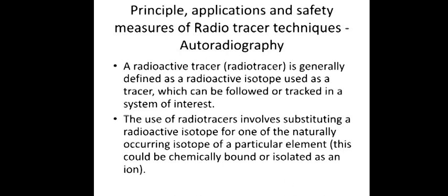So you are basically using the principle of radioactivity, knowing that there are certain isotopes which can decay over time by emitting light or particles of certain interest. It might be an alpha particle or a beta particle. And by using certain detectors you can actually detect the emitted beta or alpha particle.